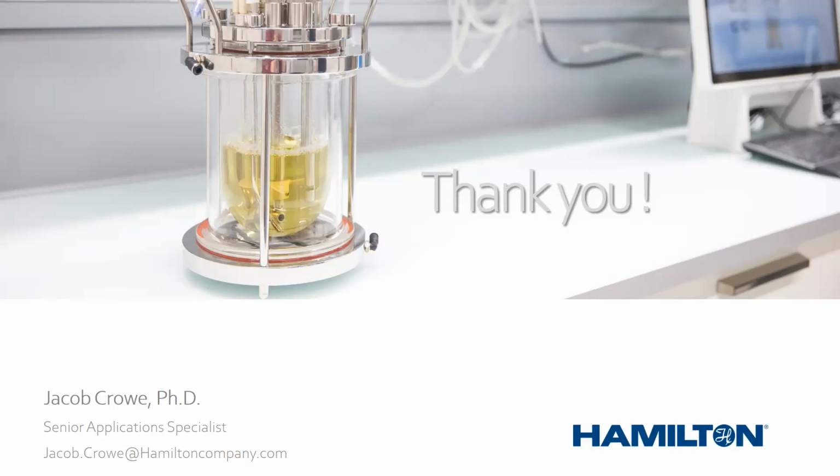Inline control systems, I've seen, will continuously adjust, and if we think about the big picture on that, you're adjusting to the dynamic nature of the cell population itself. And so in theory, and what I've seen in practice in certain papers, is that you'll get higher productivities from this because you're continuously addressing a dynamic nutrient feed requirement for a particular process.